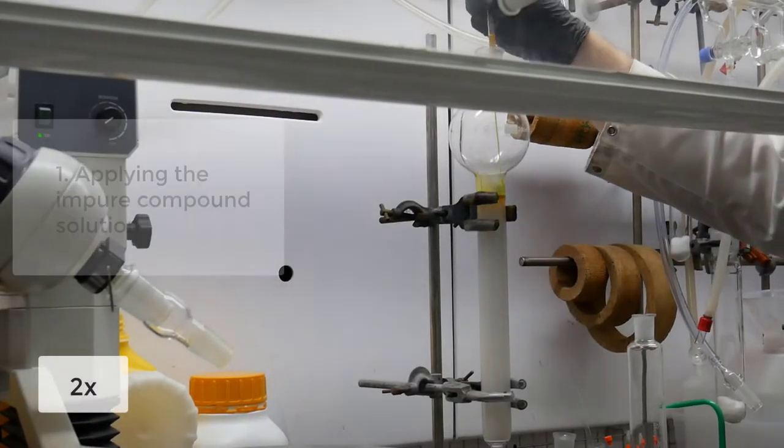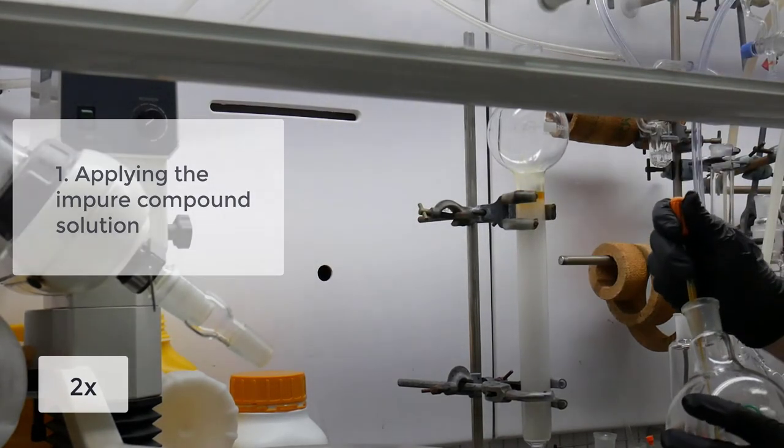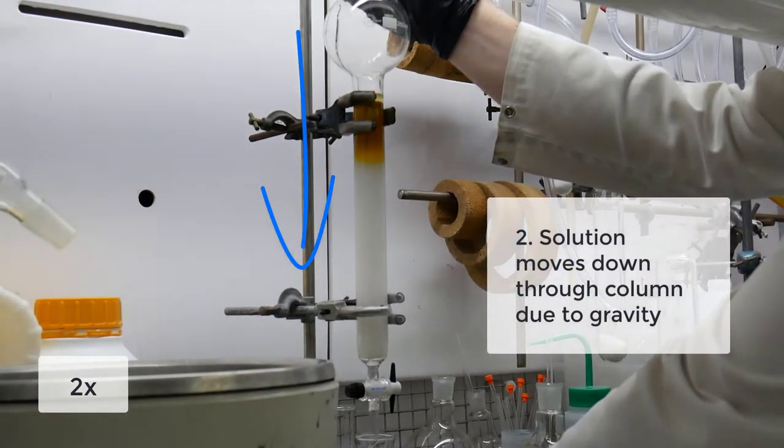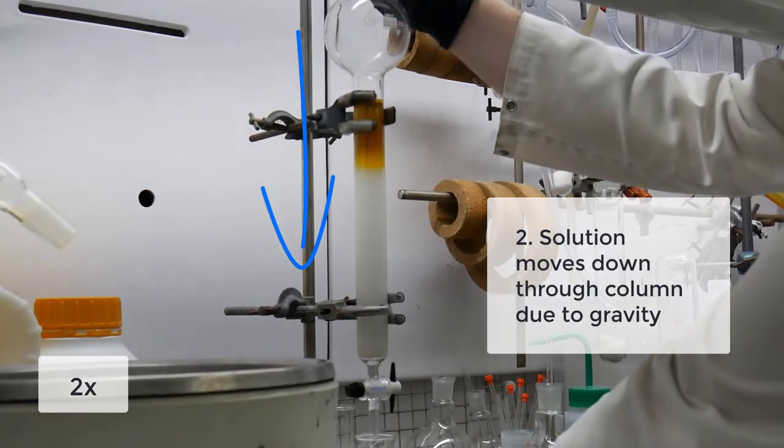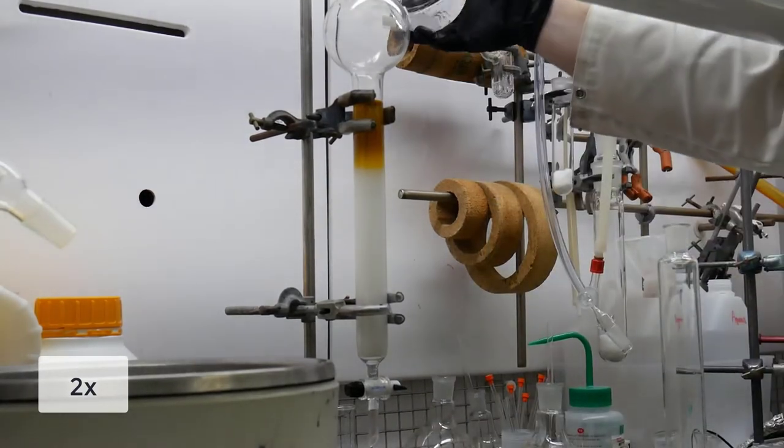Different compounds with different polarities have different affinities to the very polar stationary phase or the less polar mobile phase. If a compound is more polar, it's more likely to stick to the stationary phase and so moves slower through the silica.